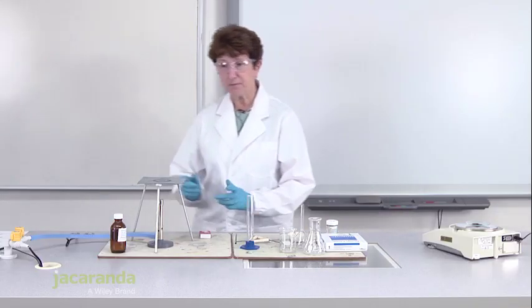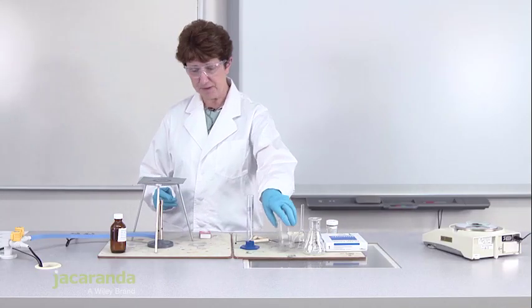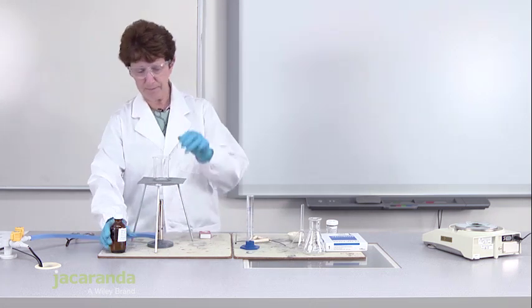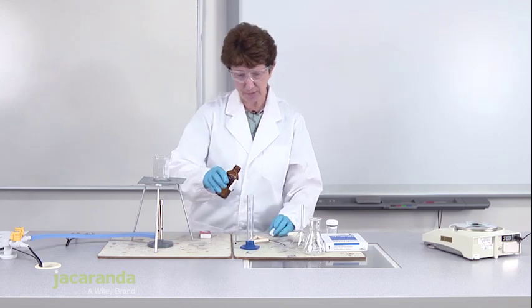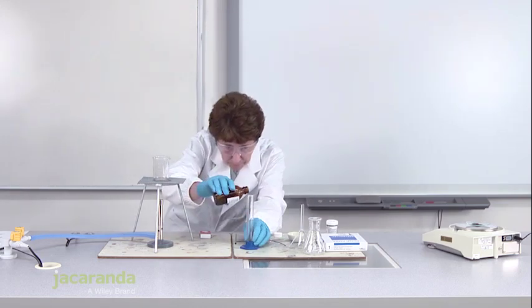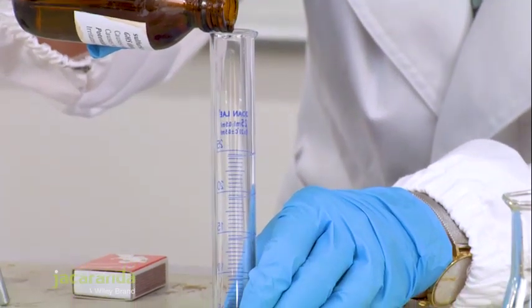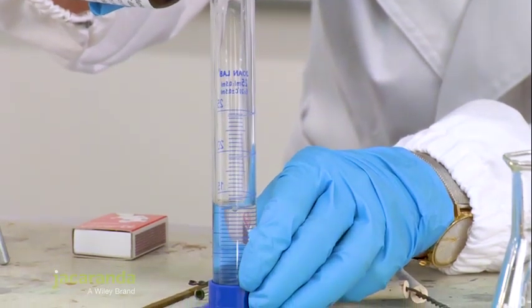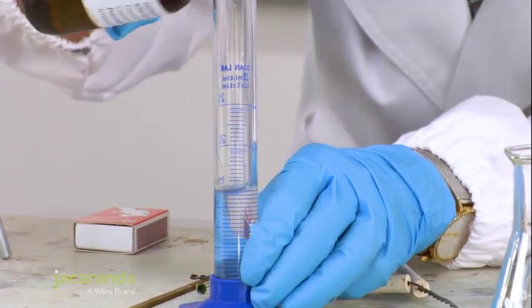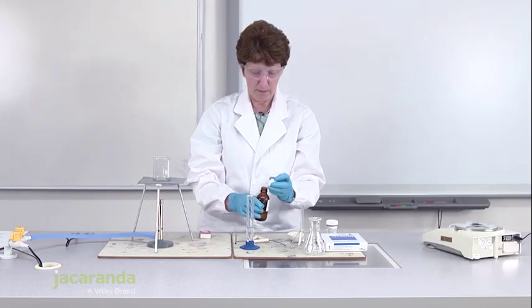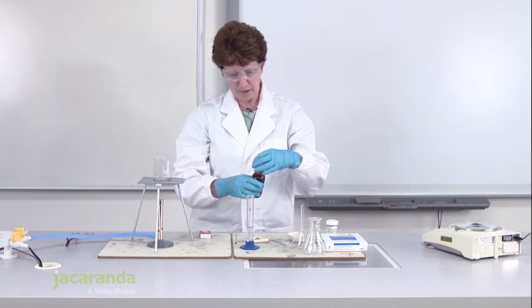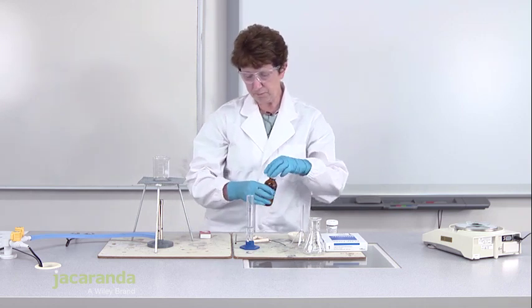Copper oxide is going to react with some sulphuric acid so I need 20ml of sulphuric acid which I'm going to warm up. I'm going to measure the 20ml of the sulphuric acid in my graduated cylinder and then pour that into a 100ml beaker.